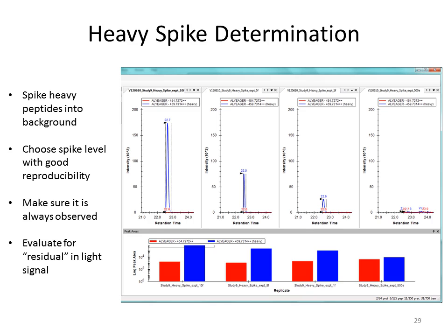So here we looked at 10, 5, 1, and 500 attomole on column just to see what we could see. And ultimately, we conducted this experiment. Blue is heavy, red is light, and red didn't have any spiked in. This is in our sample matrix. We also wanted to look for potential interferences, where we would see a different response. If you want to see this view in Skyline, you can do synchronized zooming, and you click on the most intense one and wiggle it around a little bit, and then everything else has the same y-axis and the same x-axis. That makes it nice and easy to compare.